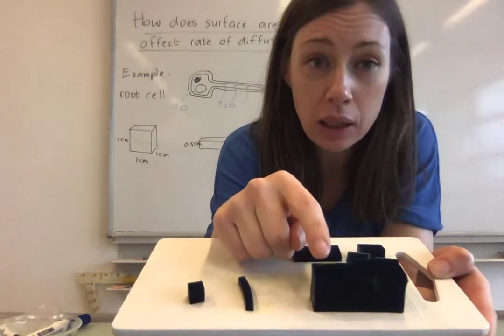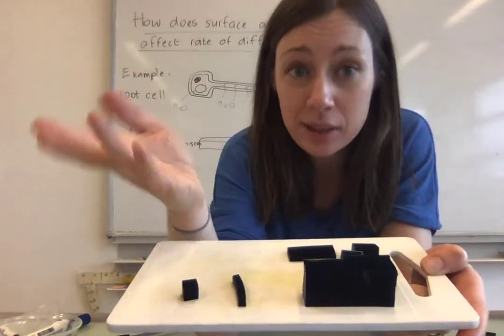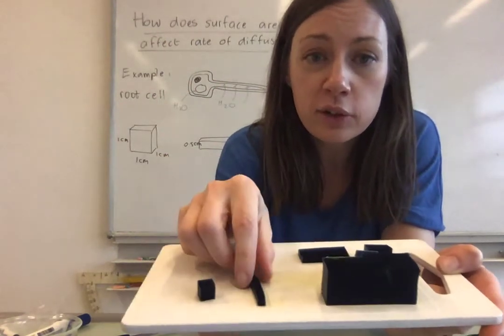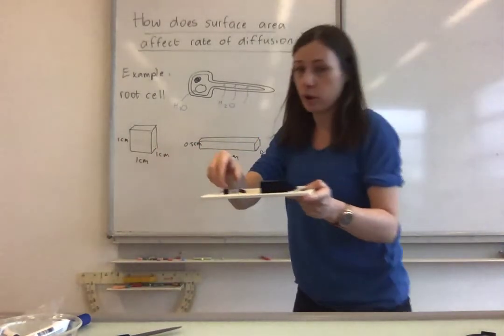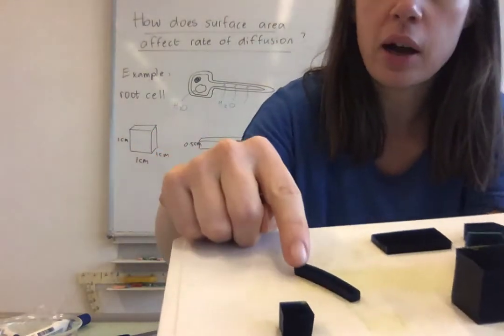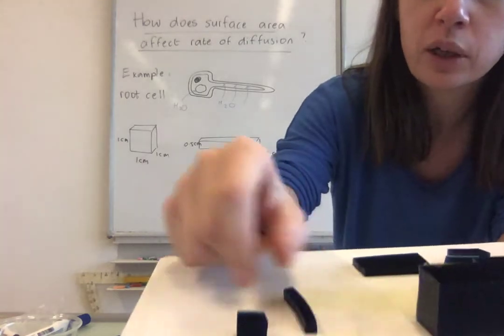It's also alkali or it's got a pH of over 7, so pH of 8, 9. And then what we're going to do, we're going to cut these into shapes. So the shape dimensions are going to be one by one by one for the cube and then this long thin one is 0.5 by 0.5 by 4 centimeters.